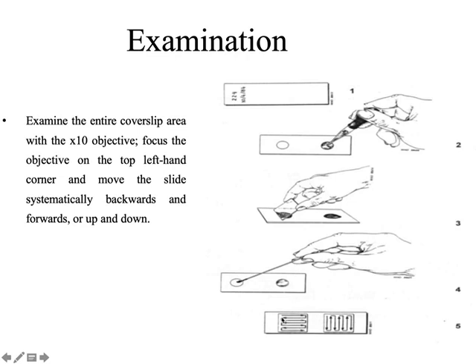Under the microscope, you have to focus like this. You have to see the slice from side to side in these directions to look for any eggs, cysts, or adults. First of all, we have to start like this: zigzag forward, and then down, up, down, up, down, up. Here is the right, left, right, left, right, left.